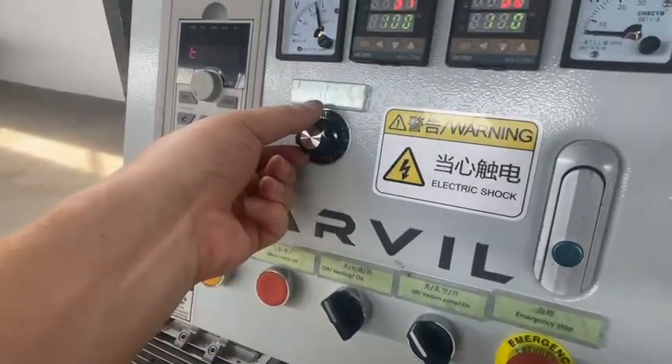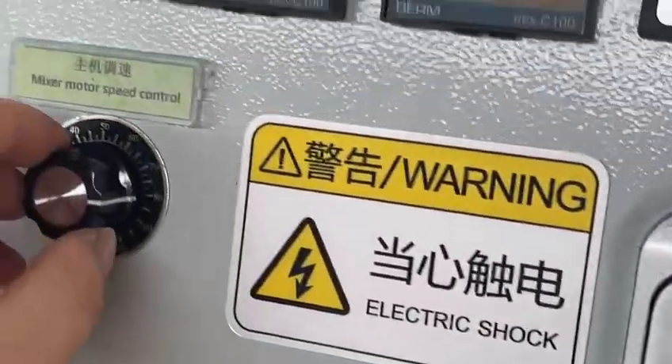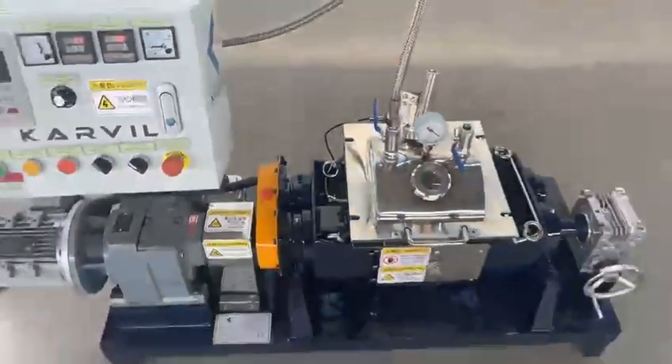And we test the reverse direction. Give it some speed. Now the double sigma blades are rotating in the reverse direction. No problem.